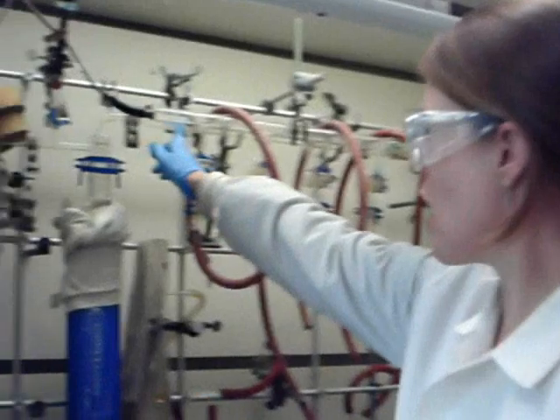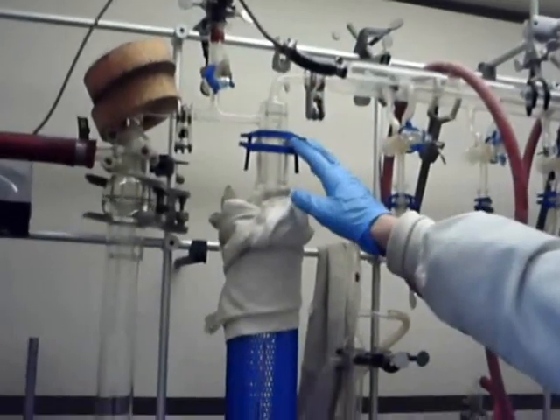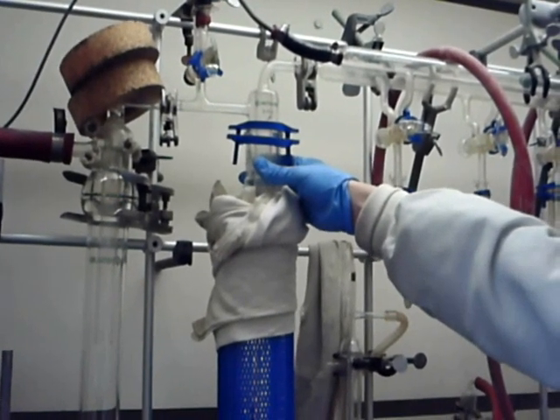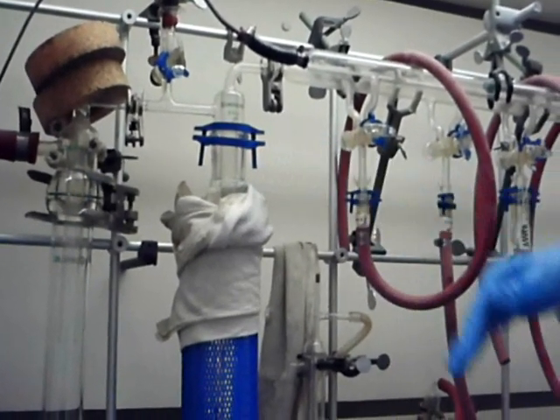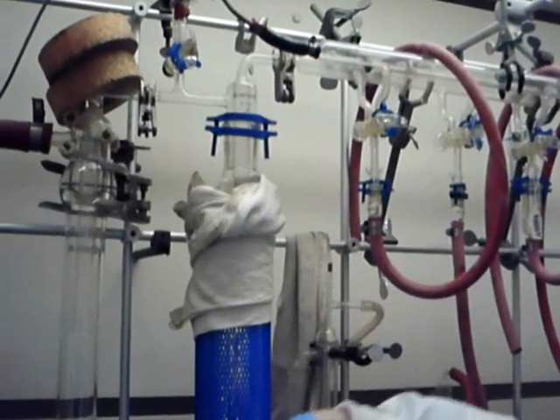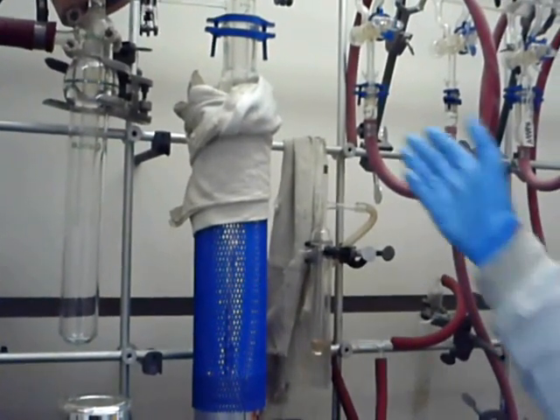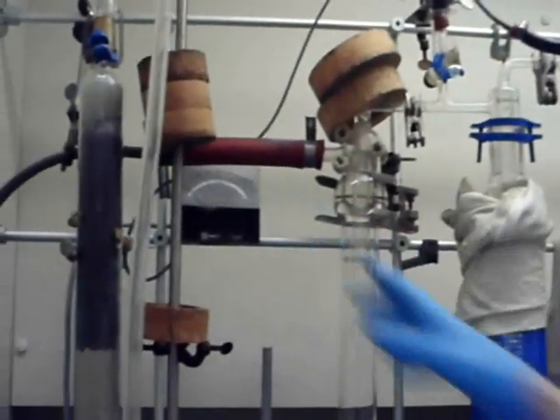And so as you can see in this system, the back line is the vacuum line. It's connected to an oil pump, and what I've done is cool one of the cold finger traps with liquid nitrogen. That's going to prevent any volatile substances from going to the vacuum pump, but will instead get stuck here in the cold finger itself. And so this vacuum pump is also connected through here to a gauge.